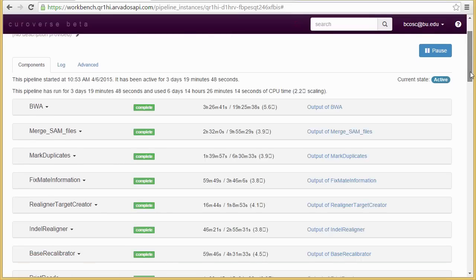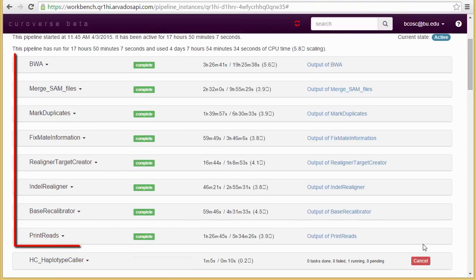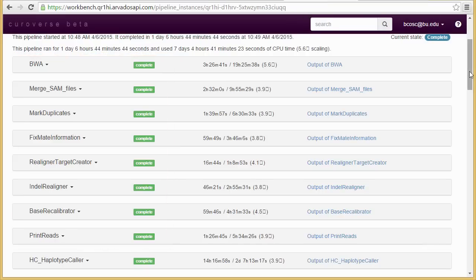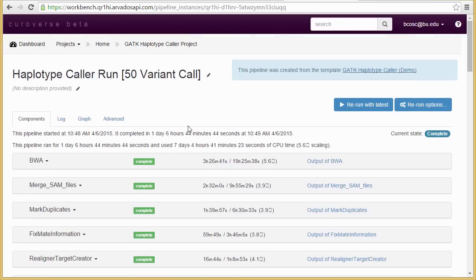For this second run, Arvados does some magic itself and just skips the jobs that have already run before and don't have any changes or use random numbers. We'll use some of our own demo magic again to skip ahead.